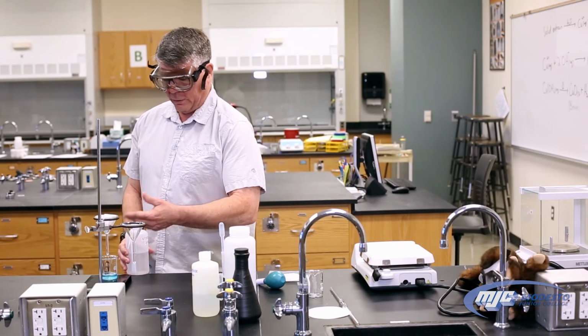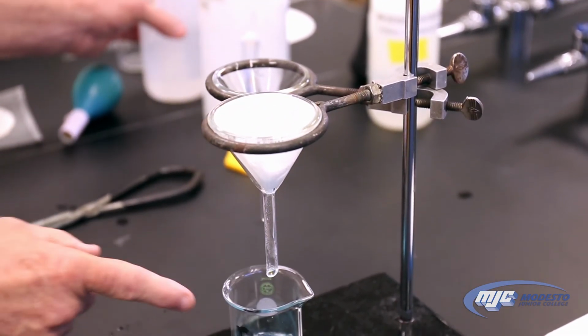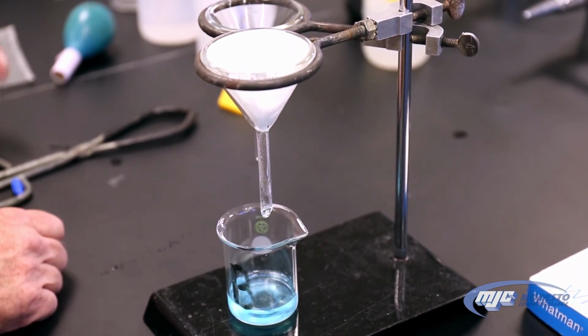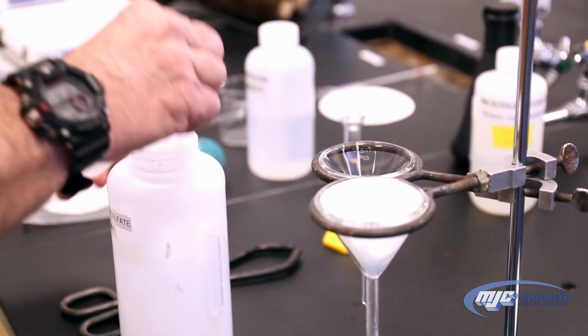Once the solution has filtered through, we're going to wash the top with a little bit of deionized water, make sure we get everything through. And we're also going to check down here. We have to make sure we got all the lead in the precipitate. So all we do is we take about 2 milliliters of our sodium sulfate. Again, about 2. We'll use the transfer pipette to measure that out.